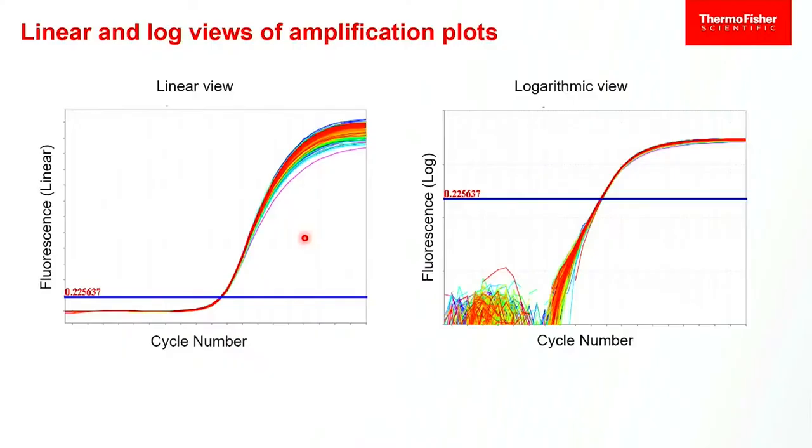You can see both. Typically, the default view is going to be the log view because we want to use it for quantification. So we're typically going to present that to you first. But you can see both.